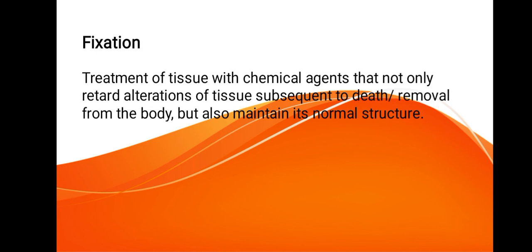Some of the most common fixative agents in light microscopy that are used in surgical and general pathology or even biomedical research are 10% neutral buffered formalin and 4% aqueous solution of formaldehyde. Fixatives cross-link proteins, thus maintaining the lifelike image of the tissue. The resulting coagulation of tissue proteins has a hardening effect on the soft tissues.